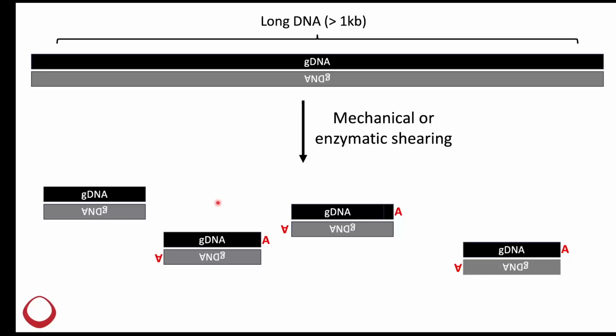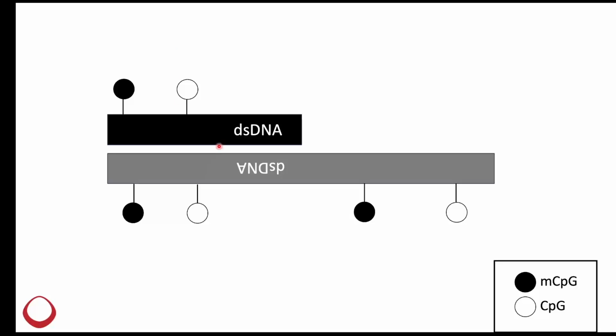It's a great strategy, and it works well for almost all types of DNA inputs. However, not so much for cell-free DNA, because end repair doesn't just fix the DNA ends, it rewrites them in a way. So let me show this easy example here.